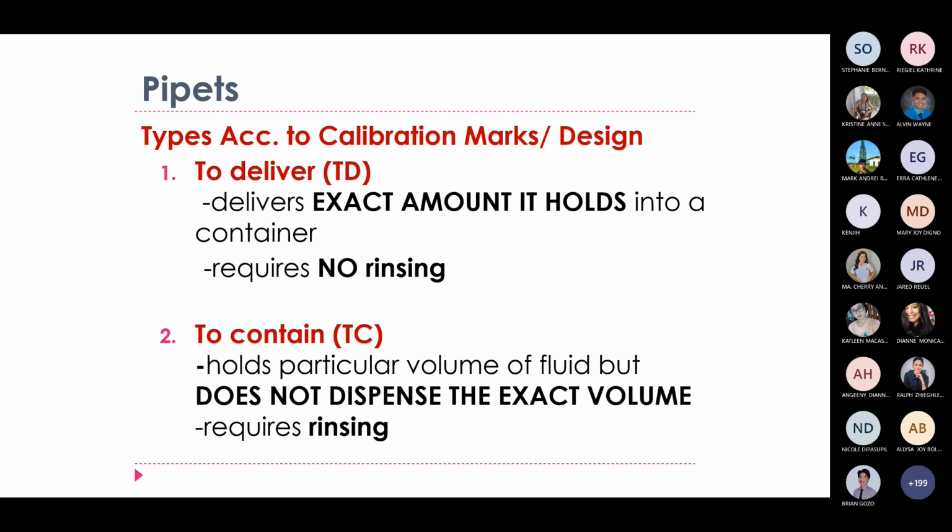When you dispense it, you operate the aspirator repeatedly so that the contents come out. Say you will mix it with another solution.